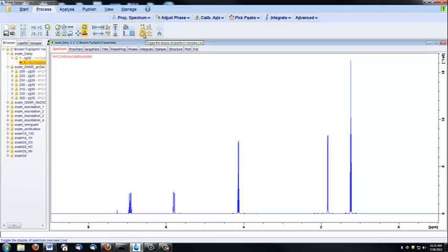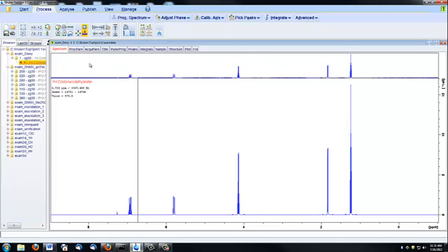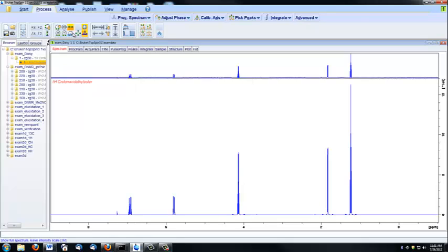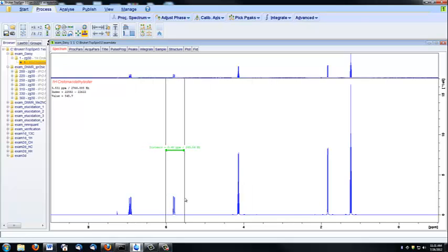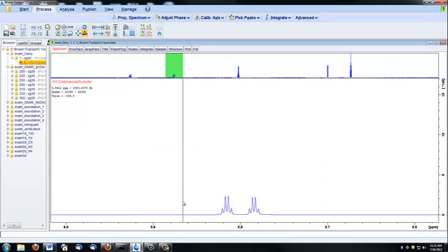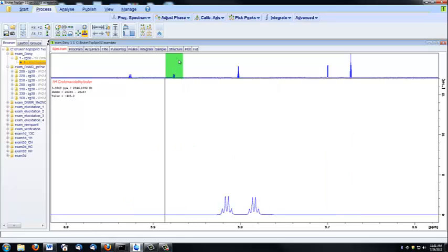The spectrum overview button is extremely helpful. If you click it, you can have an overview of your entire spectrum. So when you want to zoom in on one region or another, you can zoom in, but you'll also have a bearing on where you are on the spectrum as a whole.